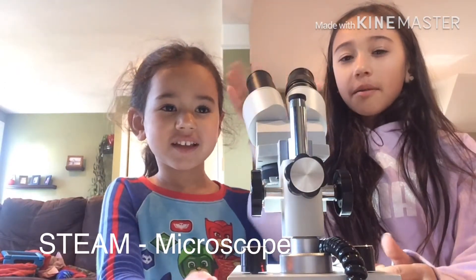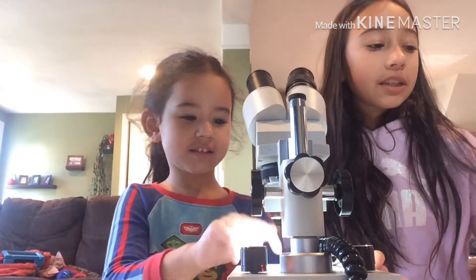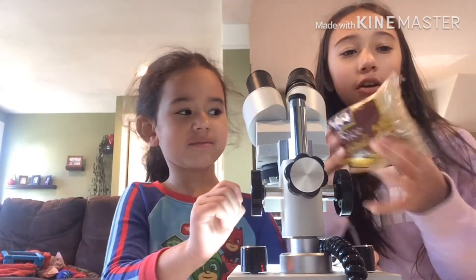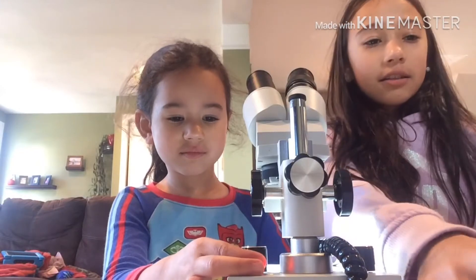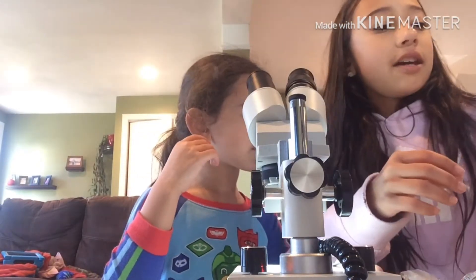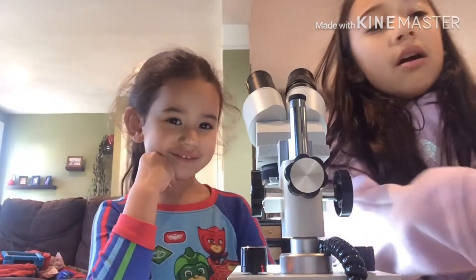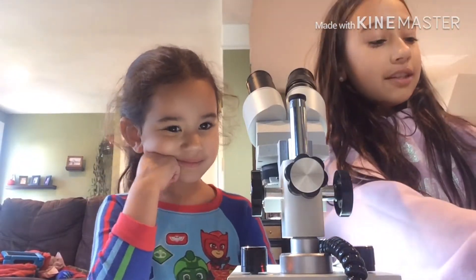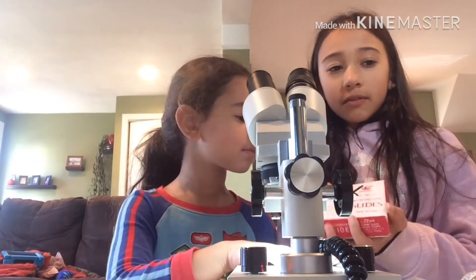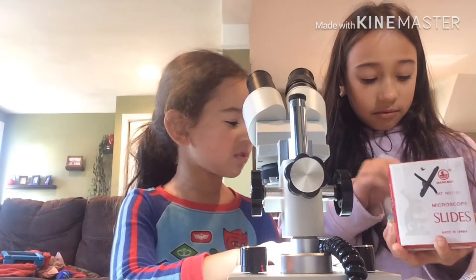Today we're going to be using the microscope to see things up close. The ingredients we're going to be using are rice, leaves, flowers, coffee, and sugar. You'll also need slides — microscope slides.